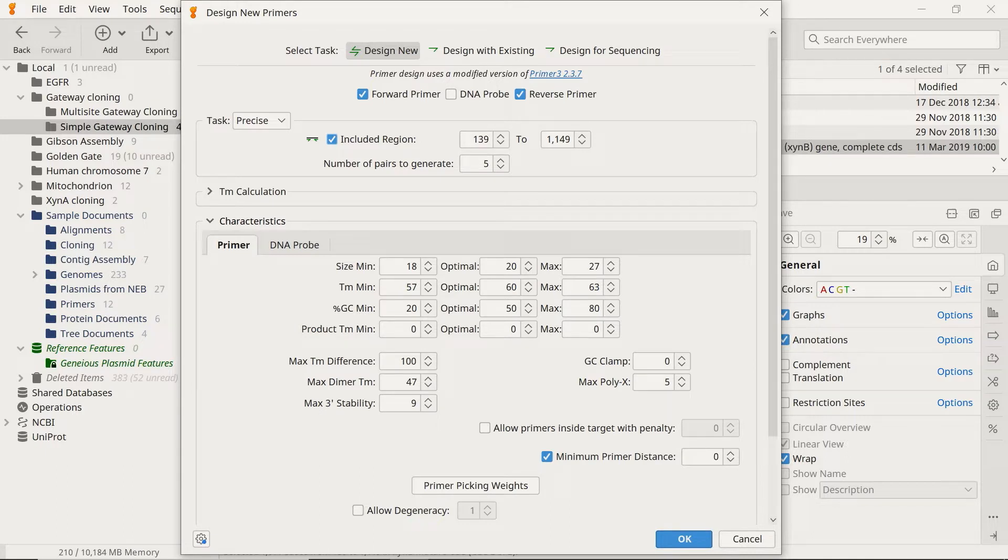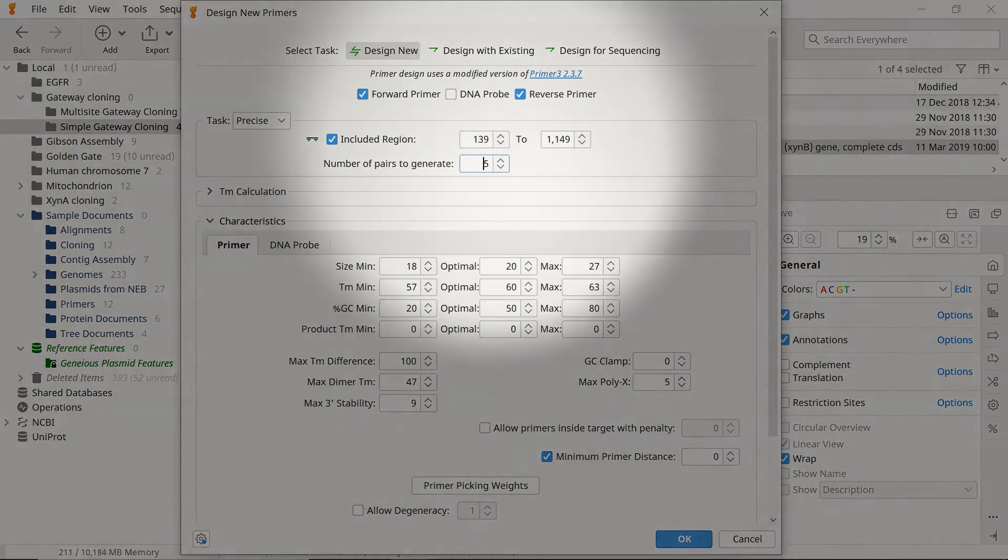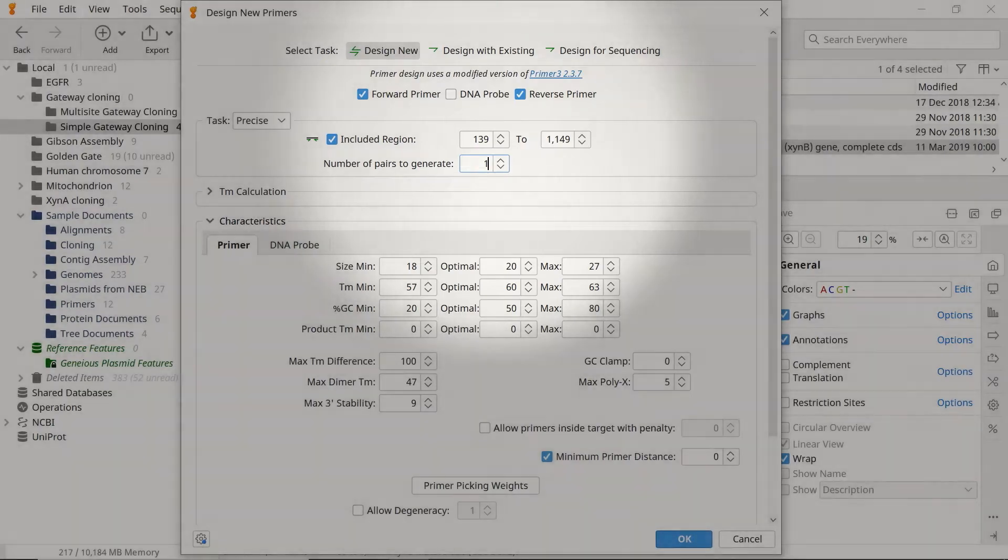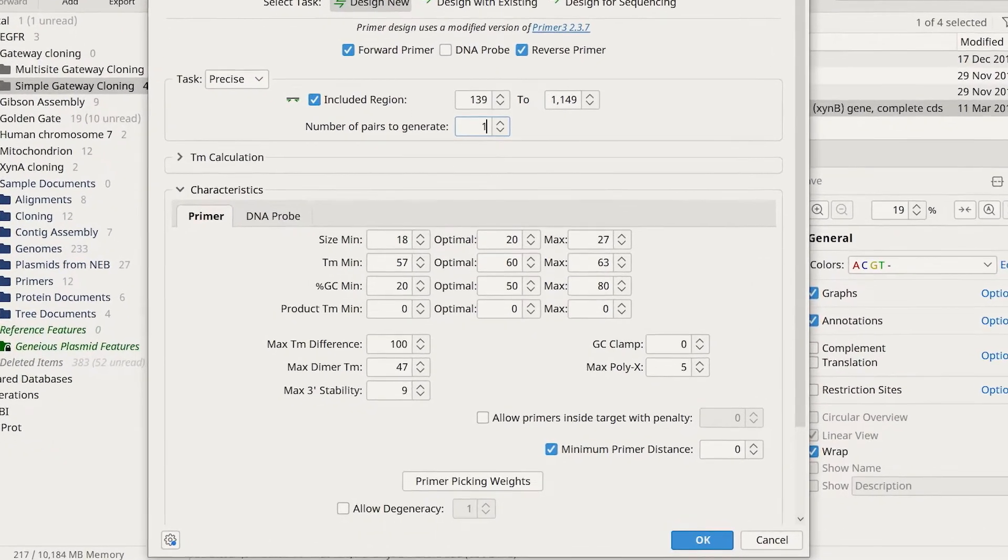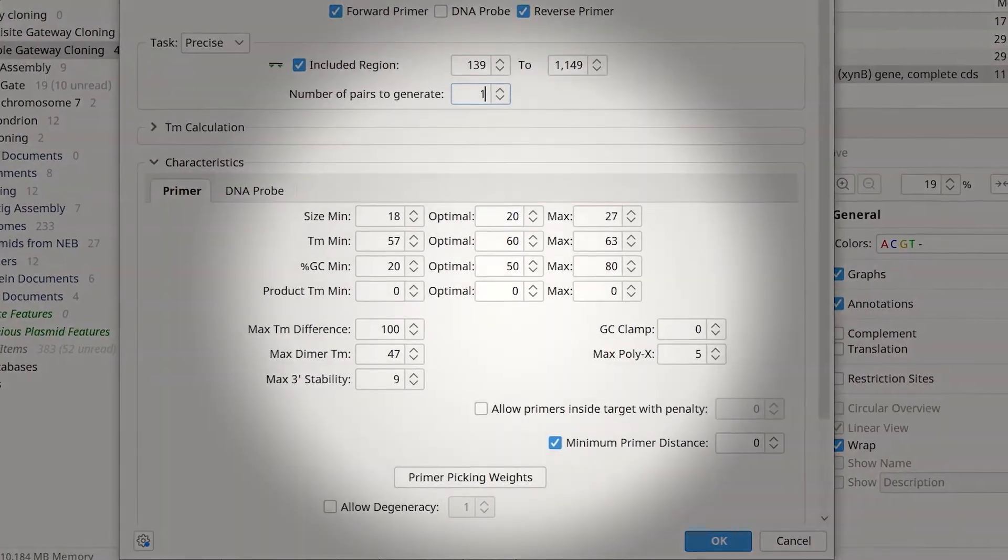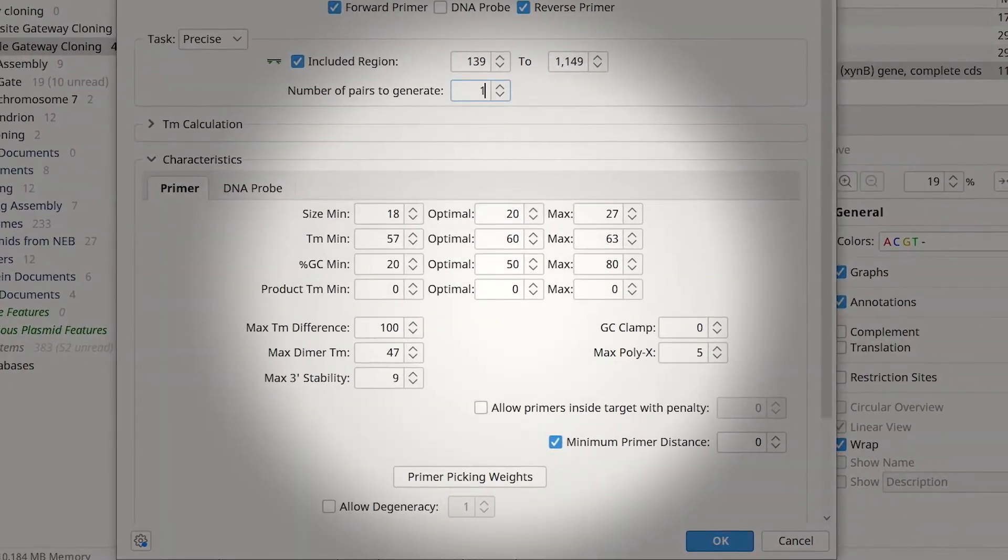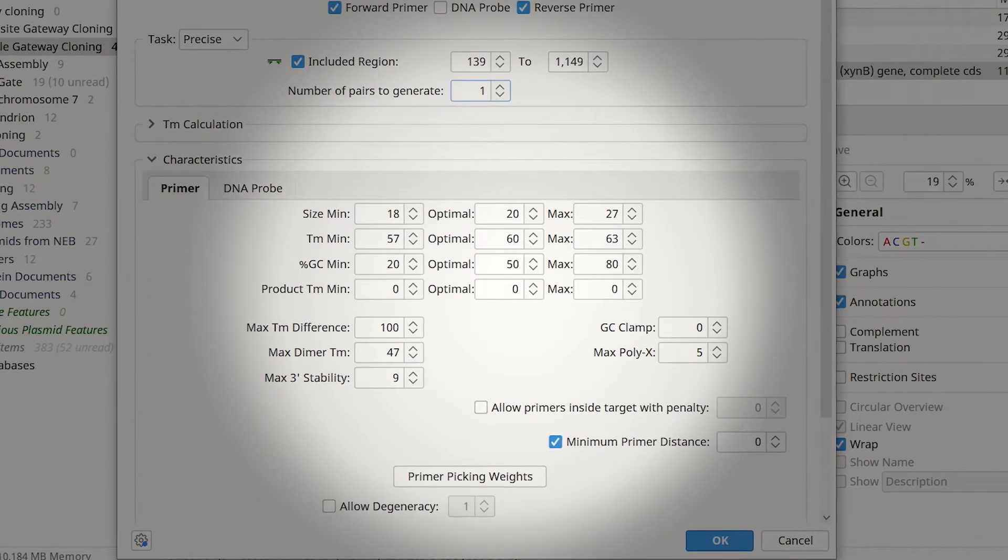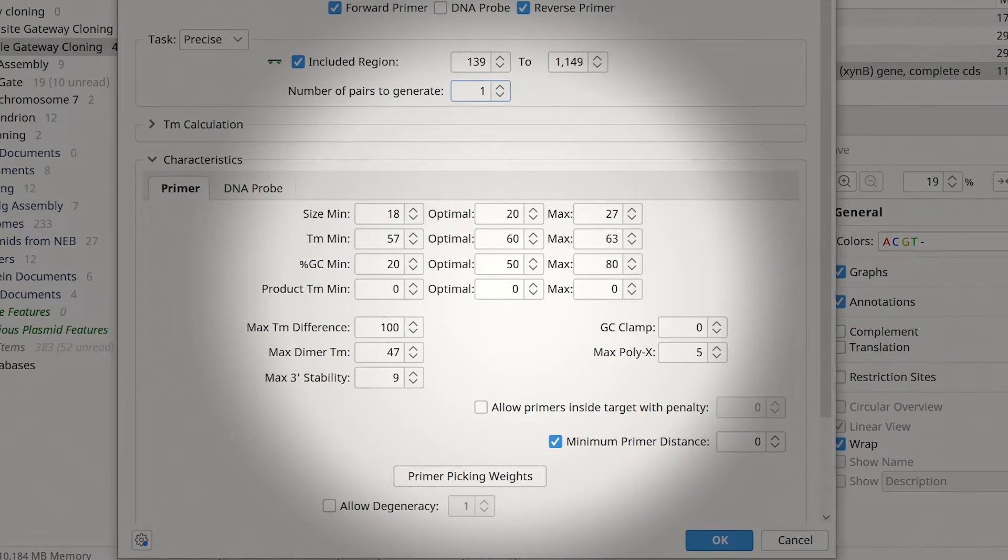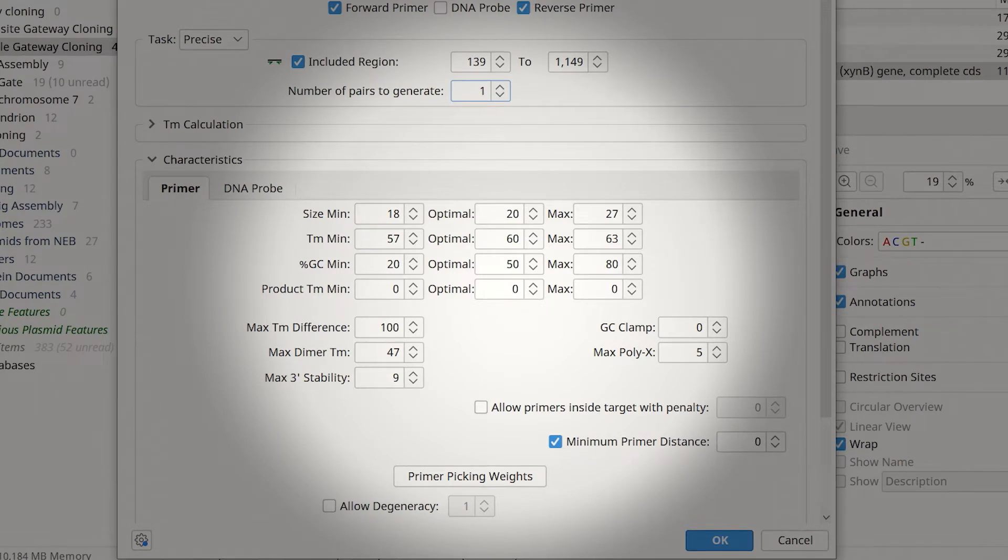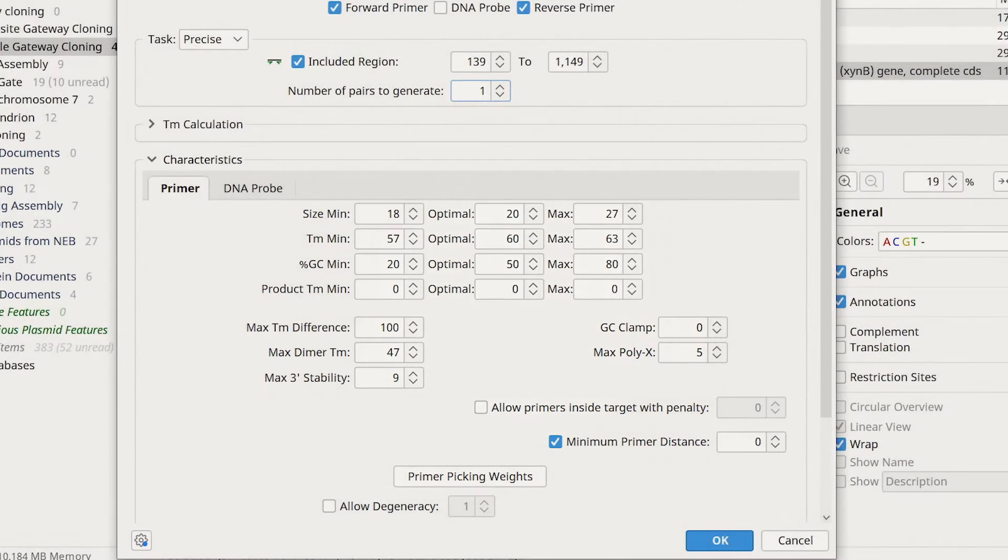Genius will then populate the region values based on this selection. Genius can also design a certain number of primer pairs. For example, entering one will create a single primer pair. Additional dropdown options allow you to adjust other settings, such as the melting temperature calculations and other characteristics, including the primer size, melting temperature and GC content.